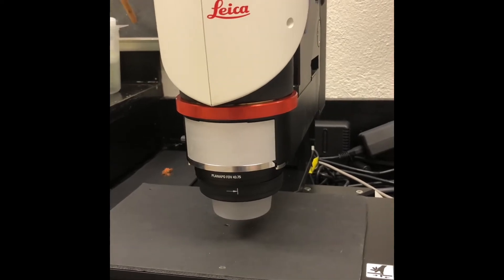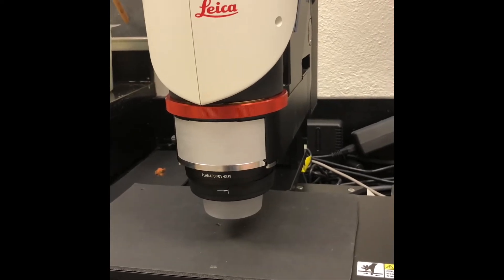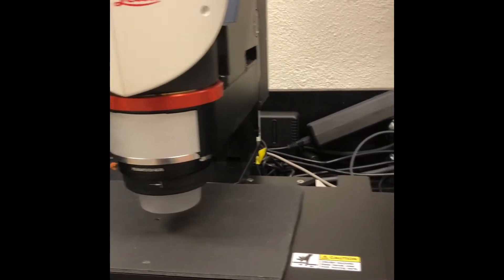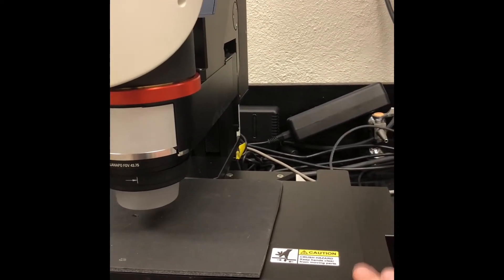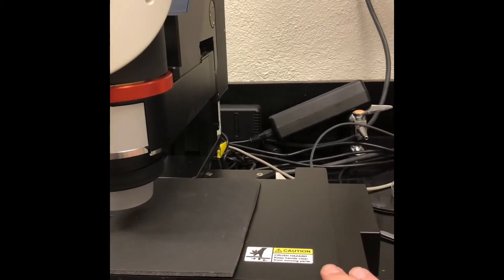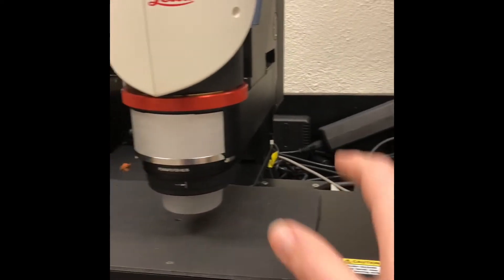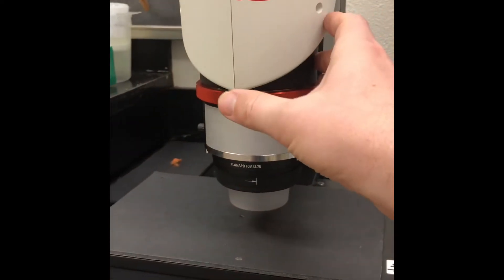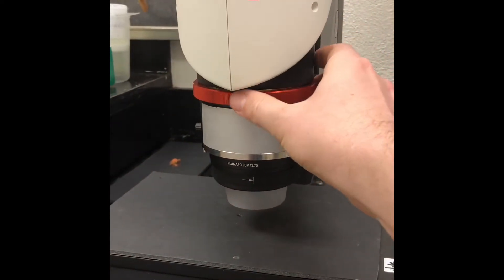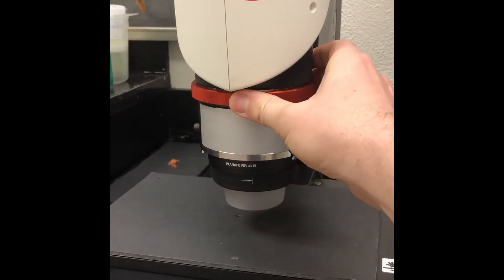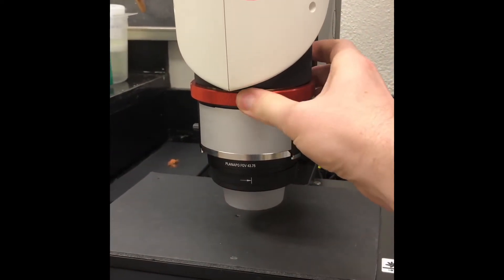So first we have the microscope itself in its powered stage, as well as the magnification ring.